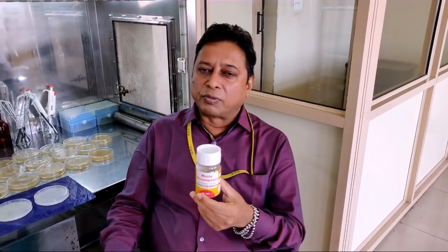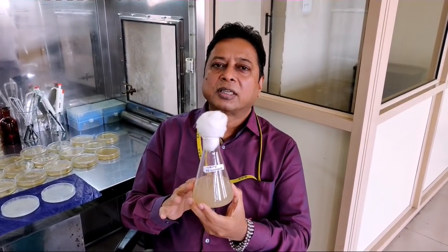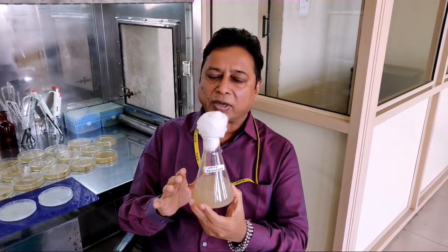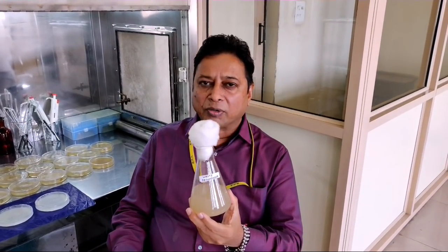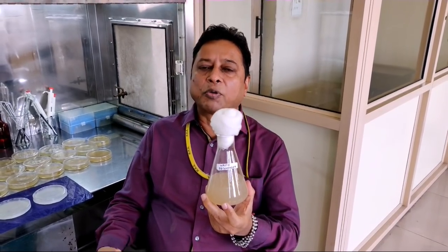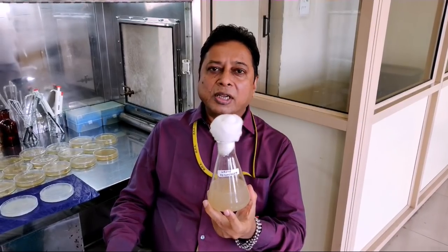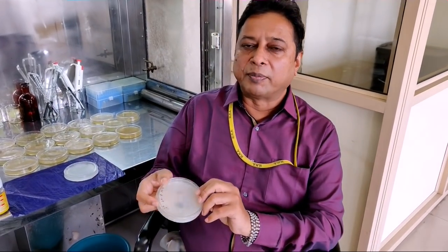We have taken this culture and multiplied it in liquid. After multiplication of 7 days, it looks like this. From this solution, we are going to test whether this contains the azotobacter or not. Dr. Praveen has tested it and found that 1 ml of our solution contains crores of azotobacter bacteria. Here are the plates — plated and after 8 days, this is how it looks.